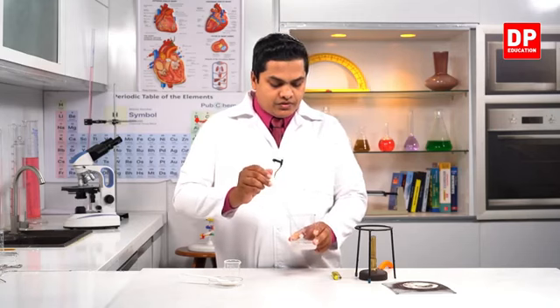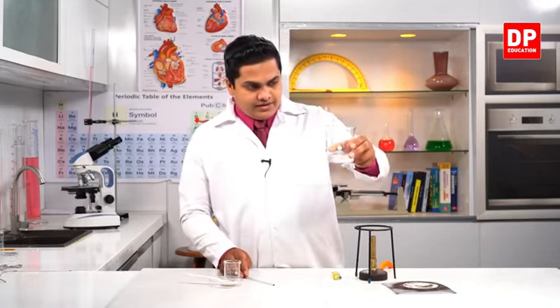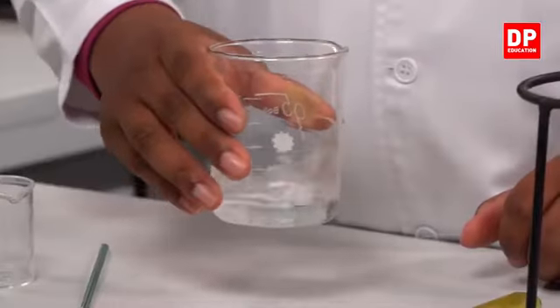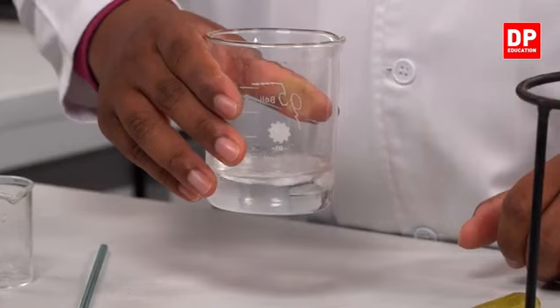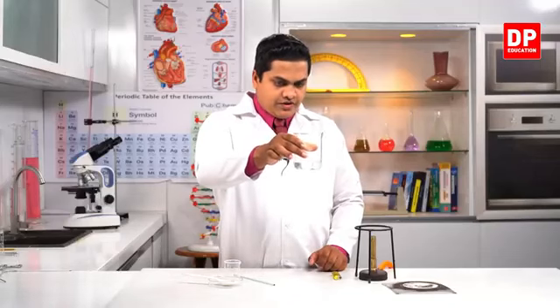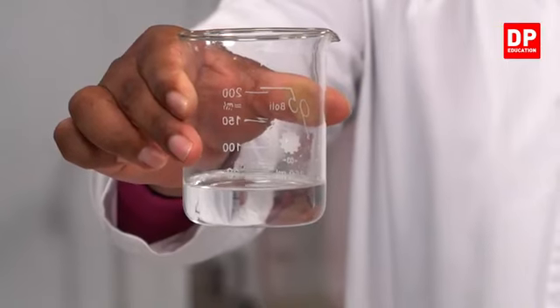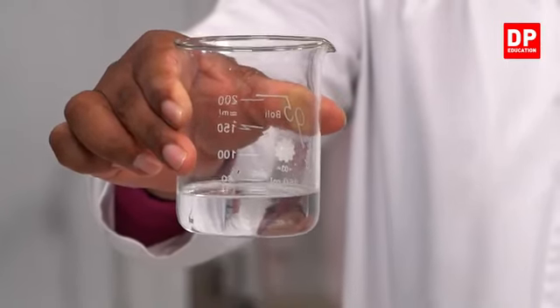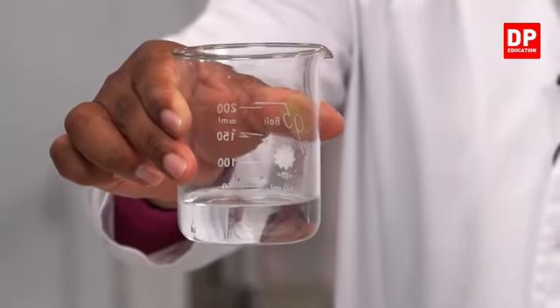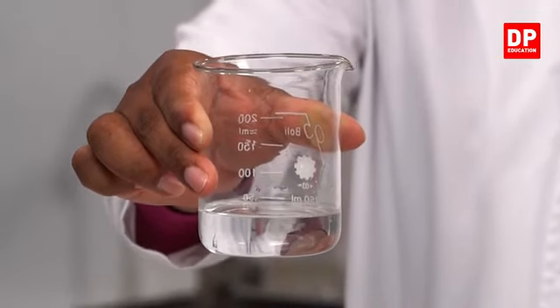You can clearly see that in here. So I'll mix somewhat. Right. So my dear children, you can clearly observe that there is no salt in it. All the salt has now dissolved inside the water beaker which I have right now.